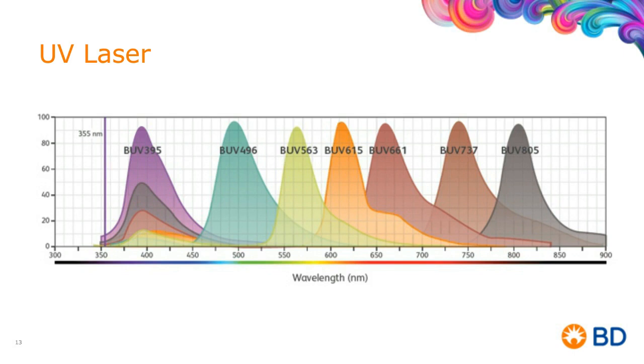Now, what's interesting to note, and the question does come up, is that when we look at all those different tandems, individuals always ask whether each is paired with the same base polymer. And the answer on that laser line is they're not. We can make a multiplicity of base polymers, and choose the appropriate base polymer that would best go with an acceptor molecule to make the greatest color.